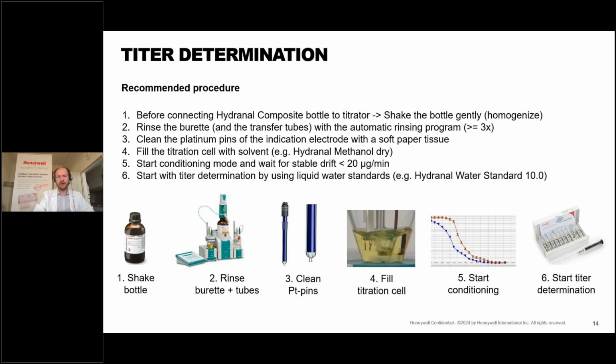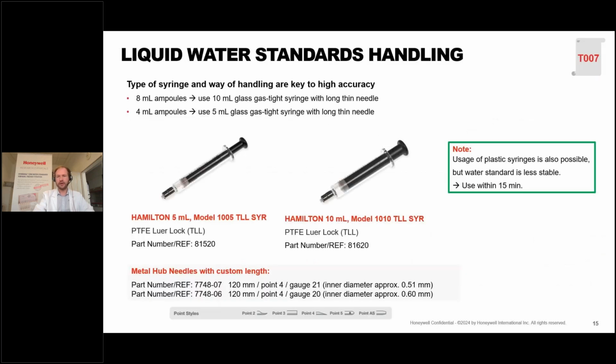For the titer determination with liquid water standards, we recommend using gas-tight glass syringes with long and thin needles. Here at our Hydranal lab and also in my application lab, we use those of Hamilton, but you can also use other brands.